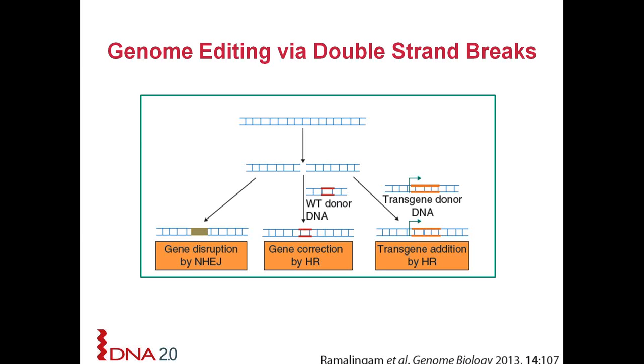Good. So clearly another theme that's coming up for a lot of our researchers is additional species. And obviously lots of you are using a variety of species, but a number of questions are coming in about when are we going to add additional species to the gRNA design tool, and what should I do if my species isn't part of that tool yet? Certainly write to us with the species that you want included in our design tool. We are happy to work with you to get that up.